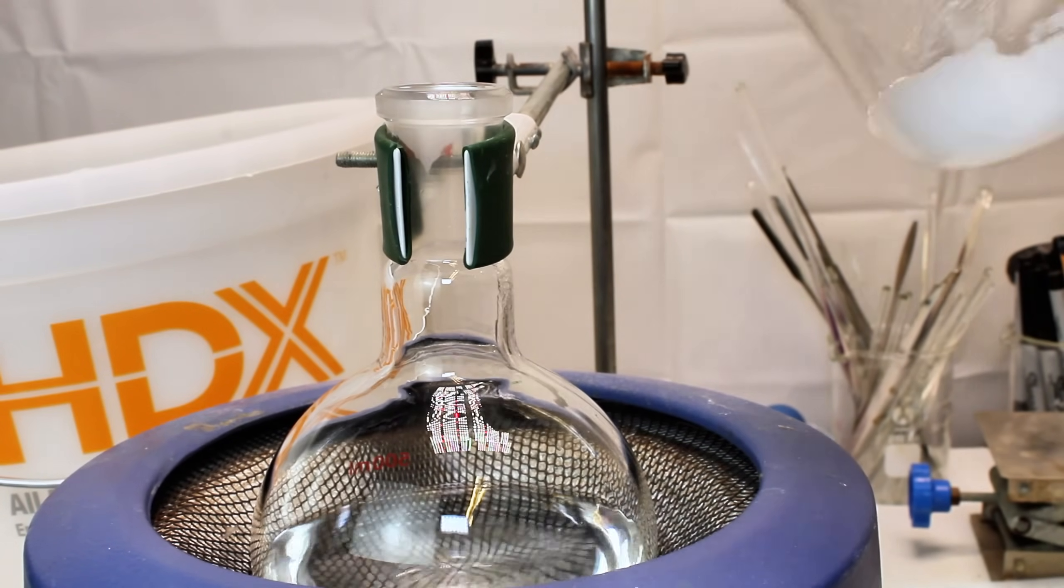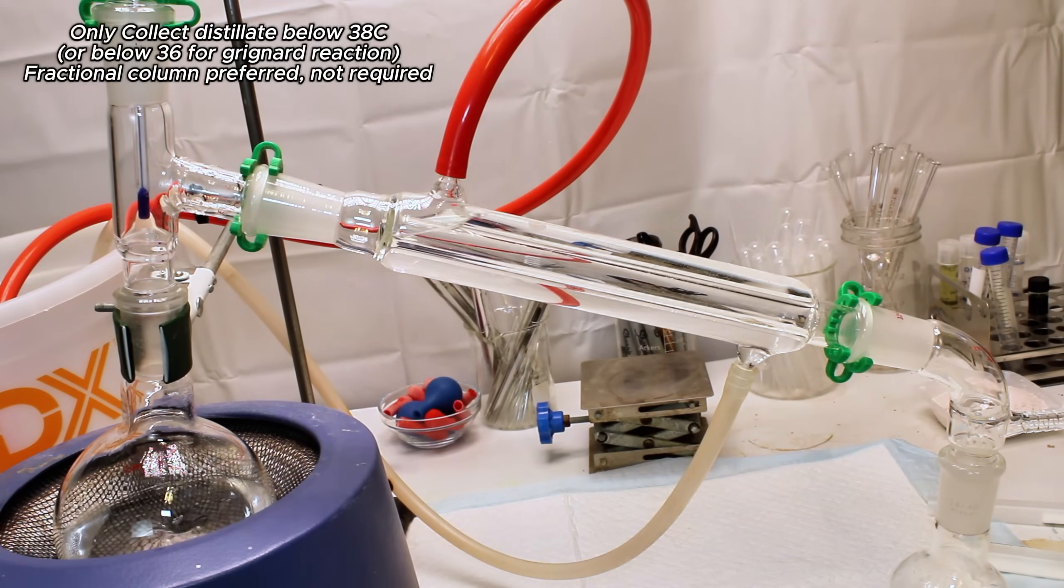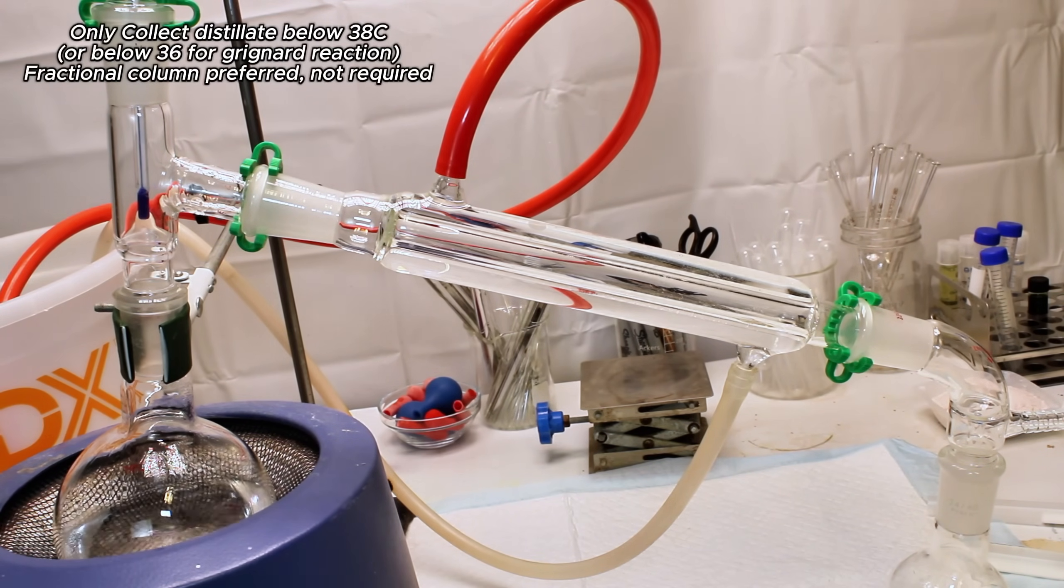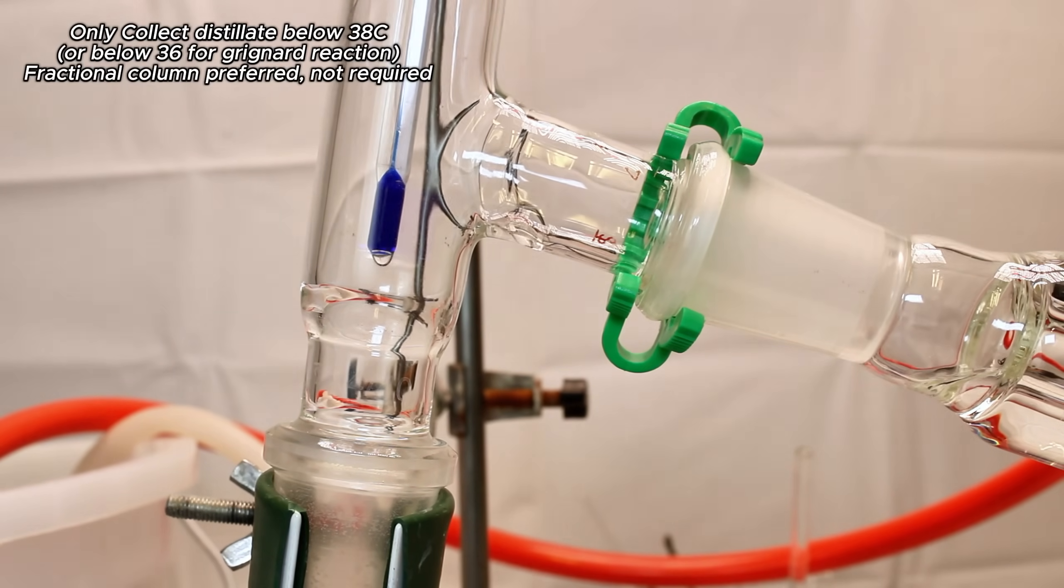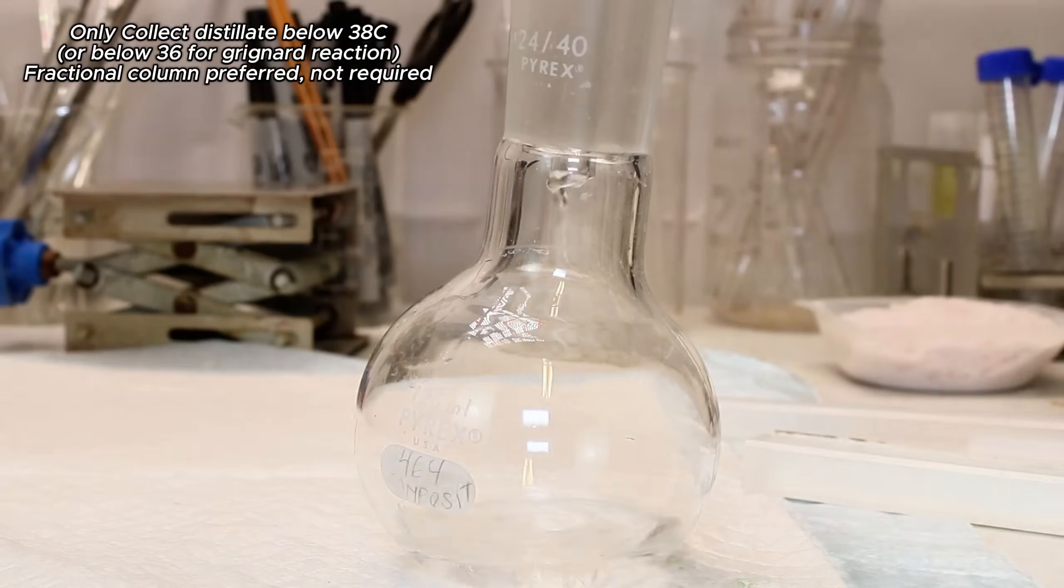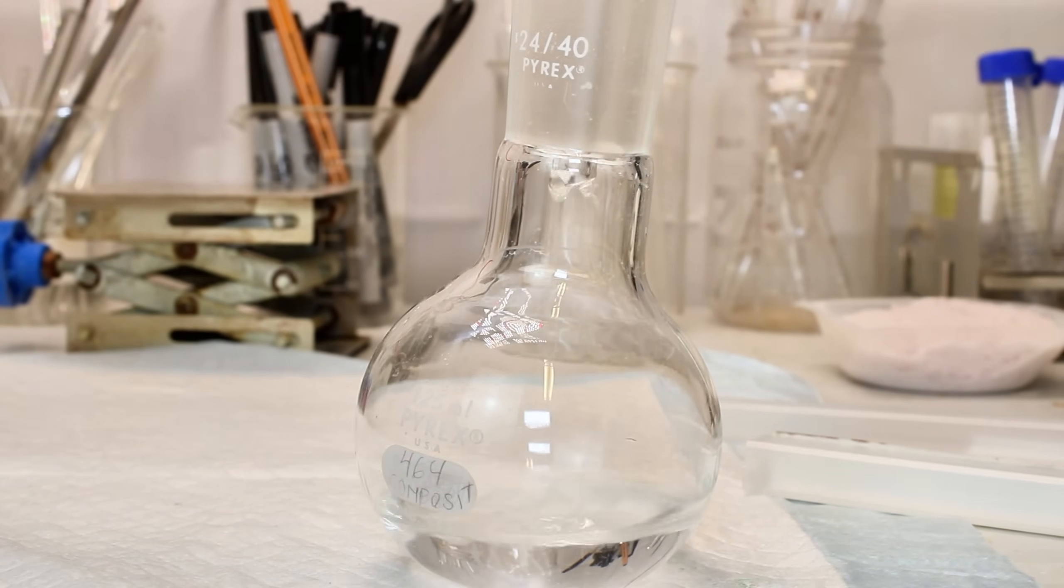In this step, I only want to collect anything that distills over below 38 degrees celsius, and this should be very pure diethyl ether. Keep in mind if you want to make ether for a Grignard reaction, you only want to collect distillate below 36 degrees celsius, and you also would probably want to use a fractional distillation column to eliminate alcohol completely.